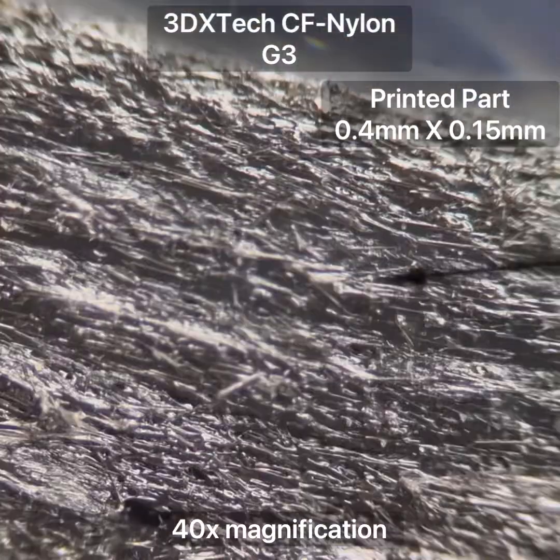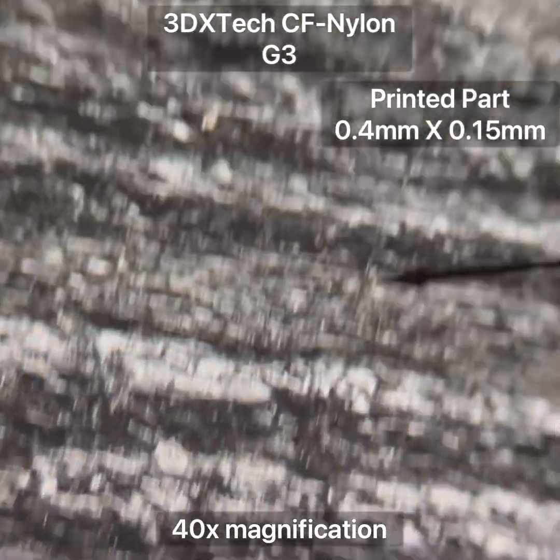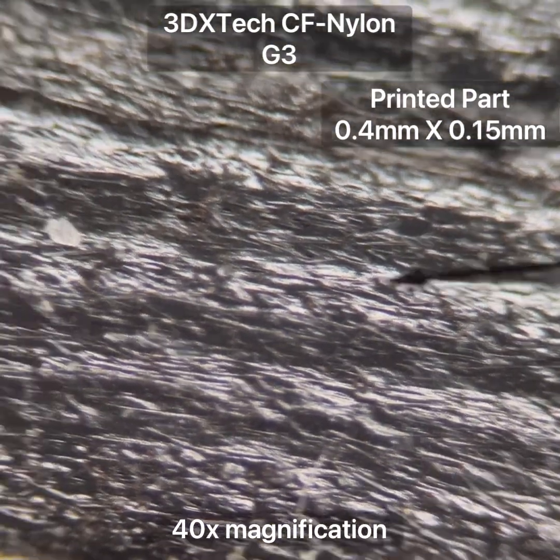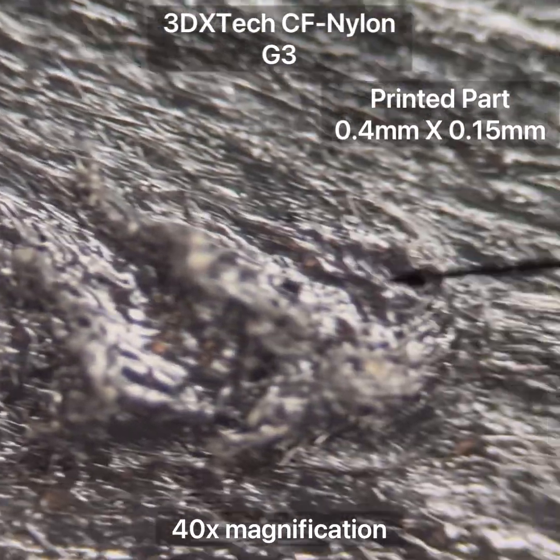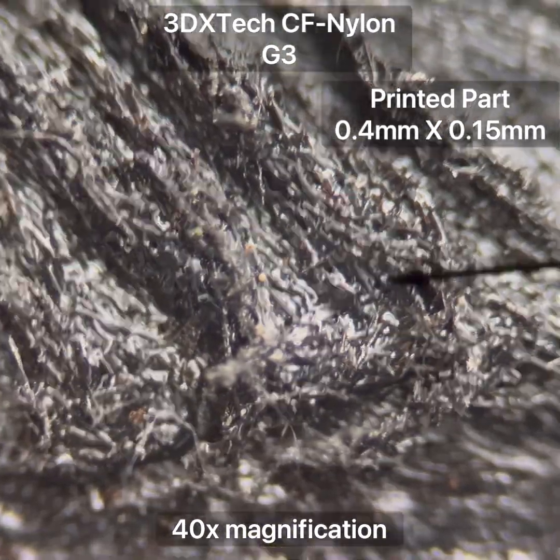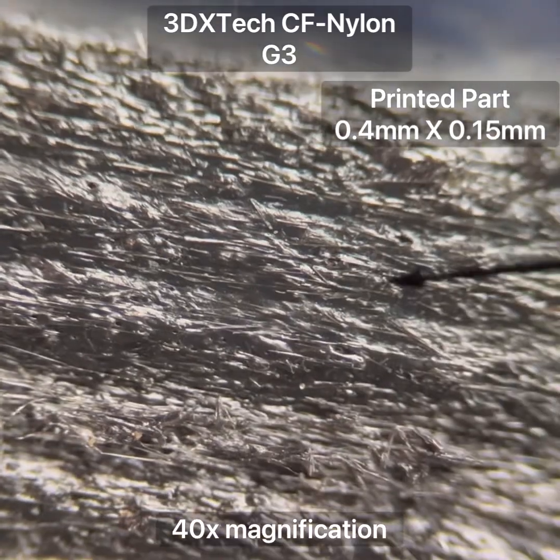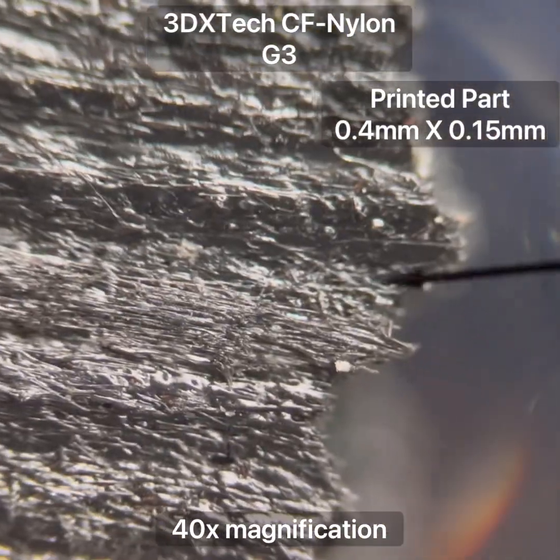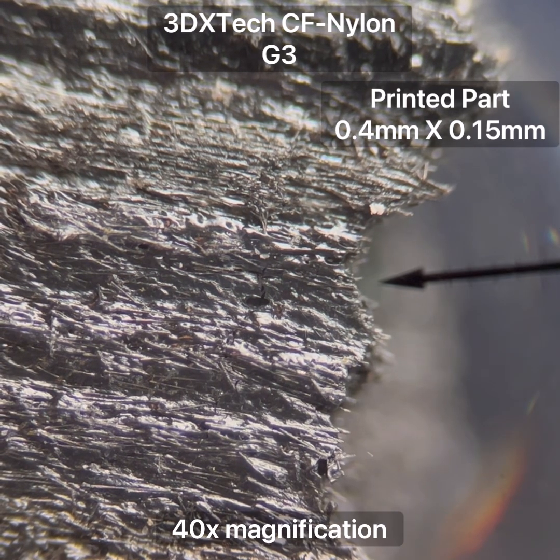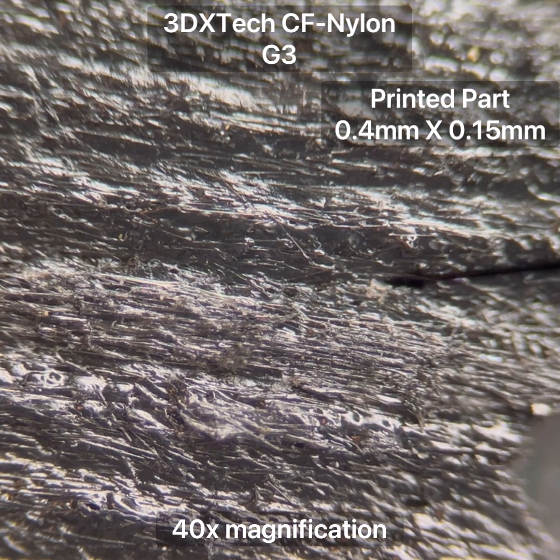This is the 3DX brand carbon fiber nylon, and here you can really tell that these fibers are all preferentially aligned with the layer lines and with the direction of the print. You can see here where there is a little bit of a corner - these fibers line up exactly with the original printing layer lines. They are not randomly oriented. So despite what people say about how the fibers might change direction somehow in the melting area of the nozzle, they become aligned as they are forced through the nozzle, preferentially.